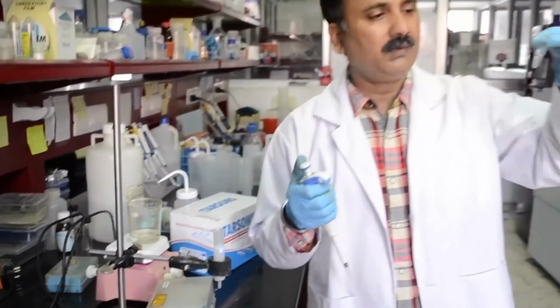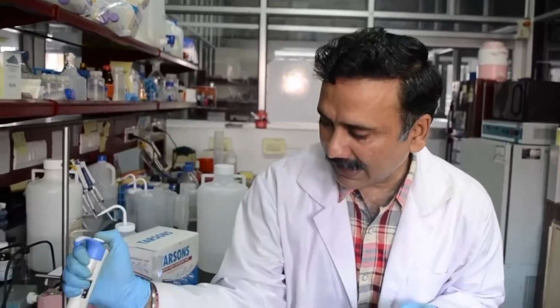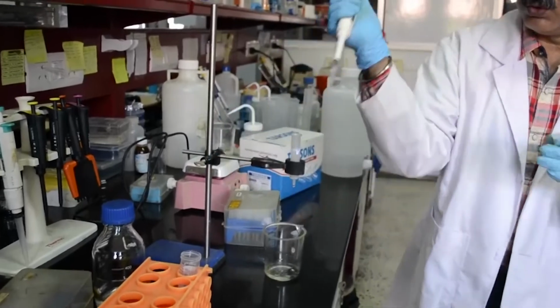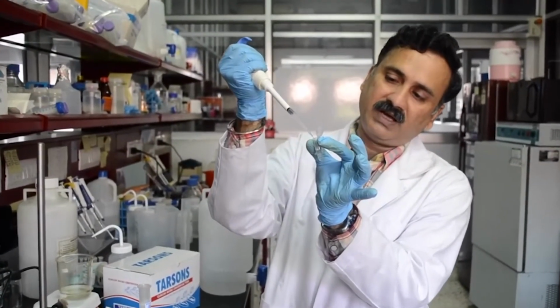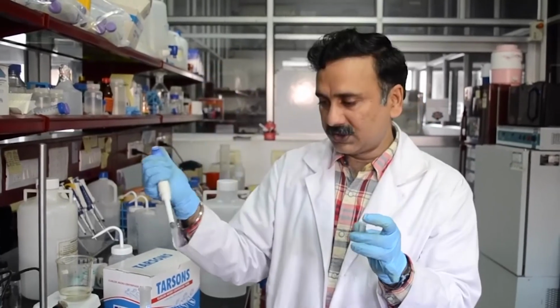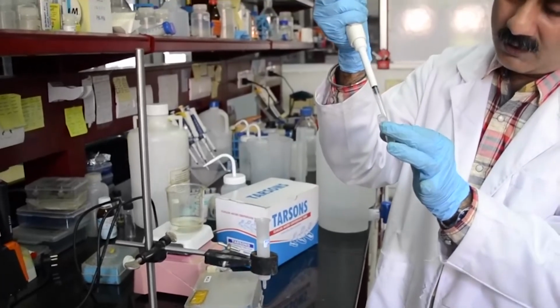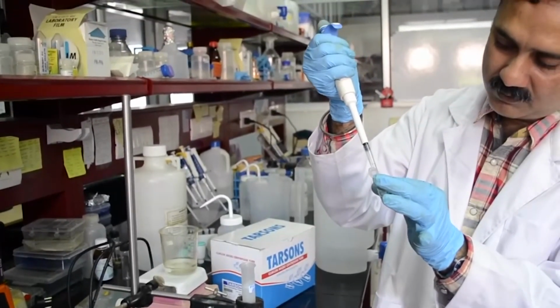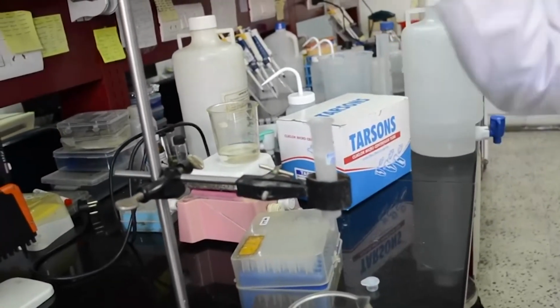In this case we have 0.5 ml of the protein. Whatever protein solution you have, you have to bring it to 1.5 ml. So you can just simply add the water or the buffer, whatever you are interested in, so that it is going to be 1.5 ml, and then you can load that. You can see the level has reached the disk, and now you can simply mix the solution first, and then load it onto the column.